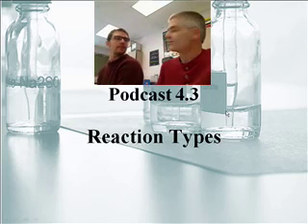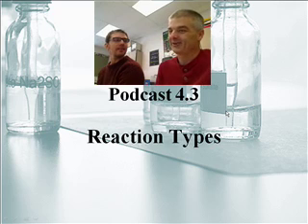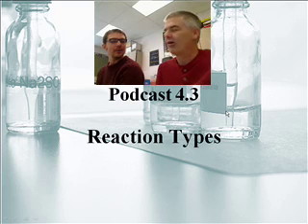Well, Mr. Sams, let's just start this right away. There's lots of cool demos. That's right. This is why you take chemistry right here. This is so cool. This is one of my favorite lessons because we get to burn things. We do. This is what everyone thinks of when they think about chemistry: all the chemical reactions. So hey, let's go.